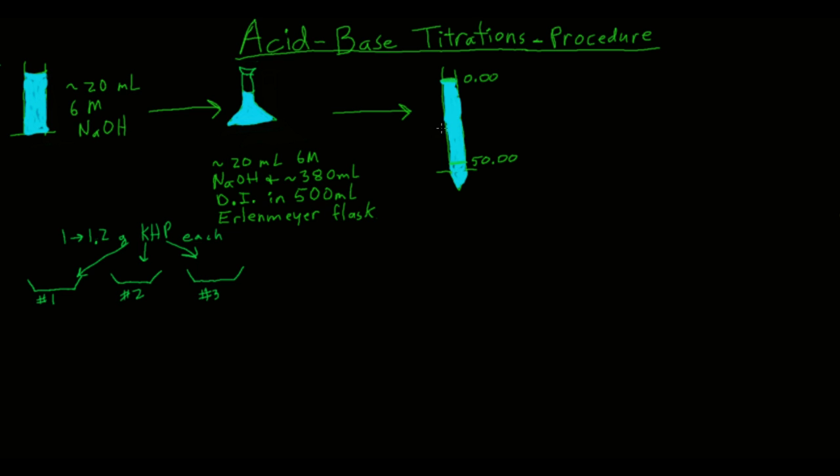Then get a 50 milliliter burette. The first thing you're going to do with that is wash it — rinse it three times with DI water. Then take some of the stock solution, add a few milliliters to the burette, swirl it around so it coats the inside, and discard it. This solution can go down the drain.